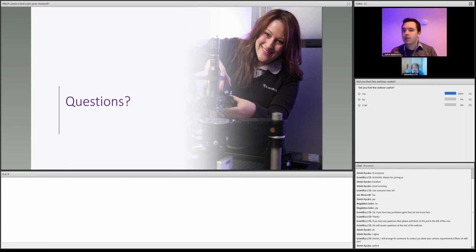So that's the recommended way to do it. The problem with averaging images is that you're not actually collecting more light, you're not overcoming the noise. You will average out photon shot noise, but if you're read noise limited, you're not overcoming that. So I would recommend always going for as long an exposure as you can, rather than the other way around. With an analog camera, you were stuck with the frame rate, so you had to average images to do a similar thing. But with a digital camera, you can set your exposure time as you want.